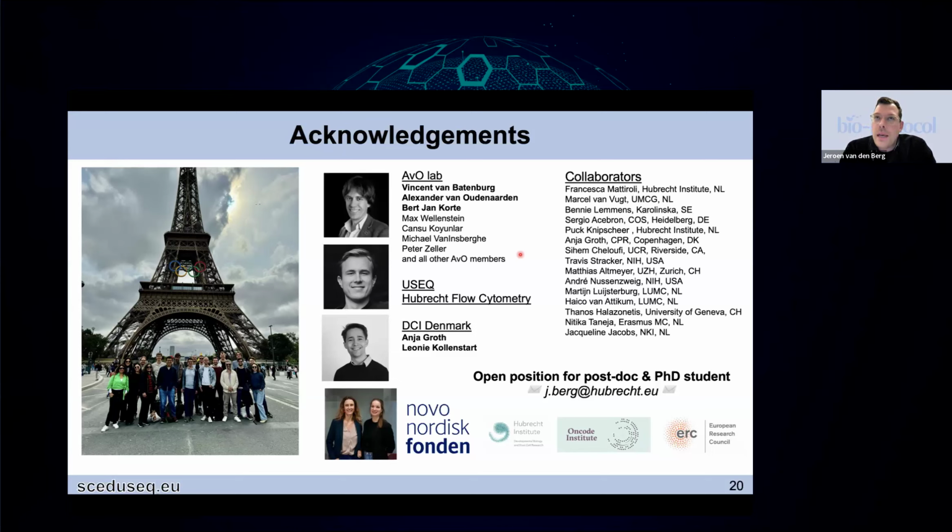For instance, I think origins and exact placements of origins are quite difficult for us. Our lowest resolution is 20 kb. If we push it, maybe 15 kb. So any measurements, as I was just describing, with multiple initiation sites in an initiation zone that's described to be 30 kb, we are completely blind to.